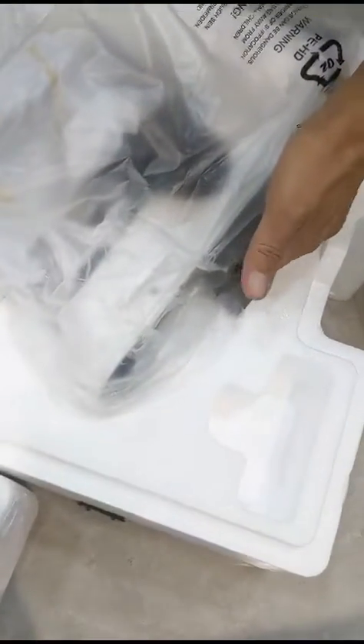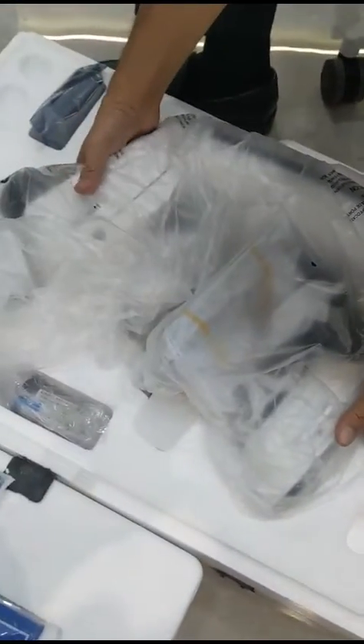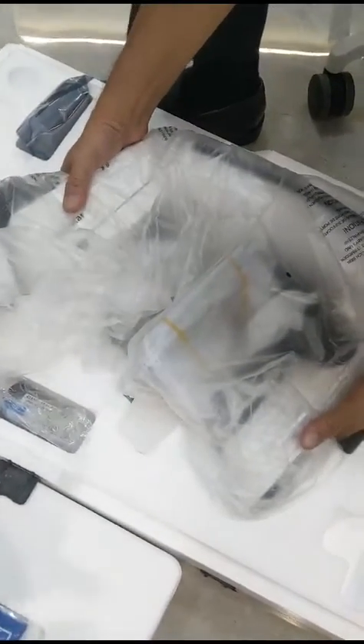Remember to hold the microscope here with your left hand and your right hand on the trinocular tube. Straight vertically lift the microscope and put it on the table.